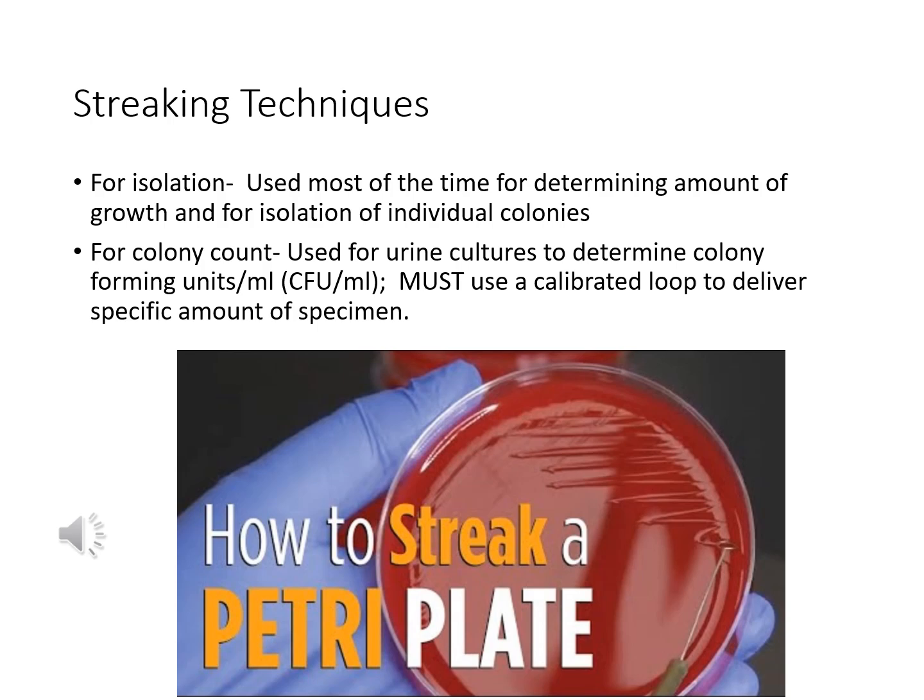You're going to do the initial streaking, and then you're going to rotate the plate in your hand and finish streaking out the other 3 quadrants. Basically, your goal is to get isolated colonies. That first quadrant you did is probably going to have the most growth because that's going to be the most concentrated. And then from there, you're doing the next one from it, and then the next one, and then the next one. So it should theoretically get to be less growth as you go.